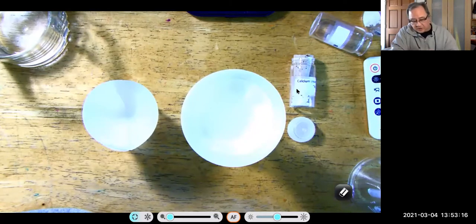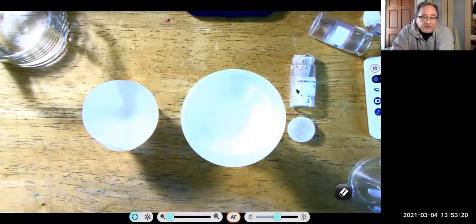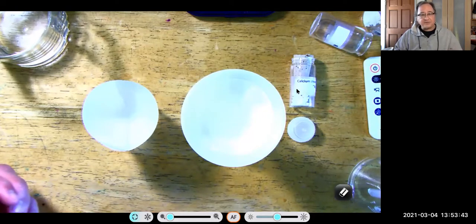Okay, so once you get the mass of your filter paper plus your calcium carbonate, you can then use the moles of calcium carbonate to figure out the moles of your compound. And since you weighed your compound to begin with, you can use the weight of your compound and the moles of your compound to figure out its molar mass and see whether it matches lithium carbonate, sodium carbonate, or potassium carbonate, and figure out what your unknown is.